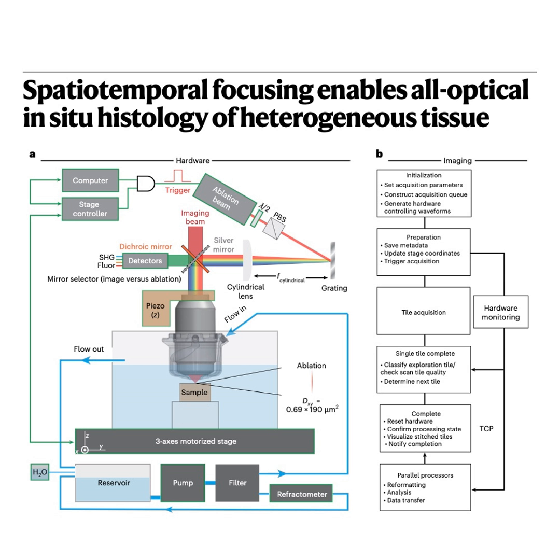What happens? The bone resists the blade, it's tough. But the soft tissue gets distorted, compressed, maybe shrinks unevenly. It's basically guaranteed to deform. So you lose the true structure, especially at the boundaries. Precisely. Those critical interfaces, like where a tiny blood vessel crosses from the skull through the membranes, the meninges, and dives into the brain, that delicate connection gets destroyed by mechanical cutting.